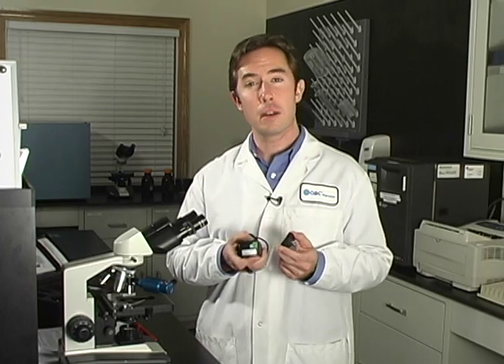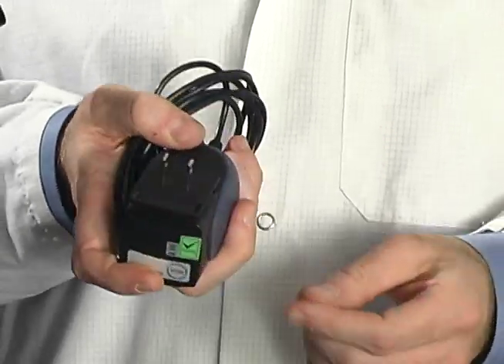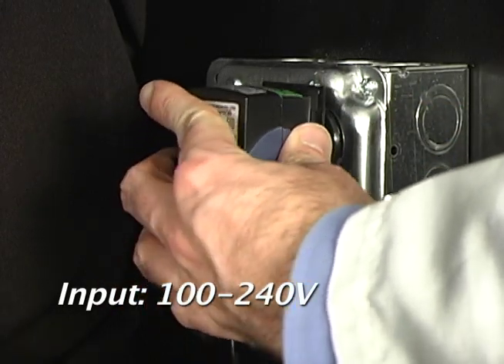To connect the power pack, first attach the correct adapter plug. Then, plug one end directly into the LED light source and the other end into an approved electrical outlet.